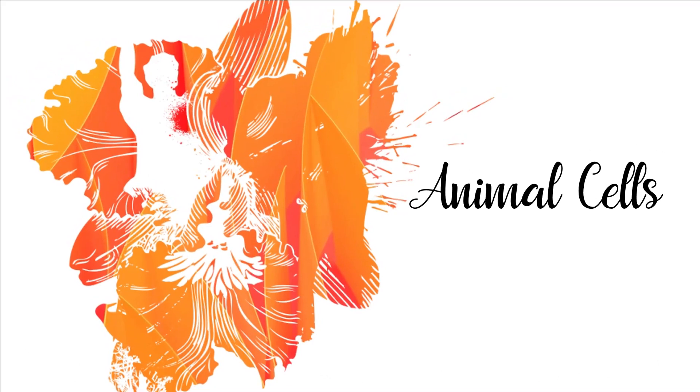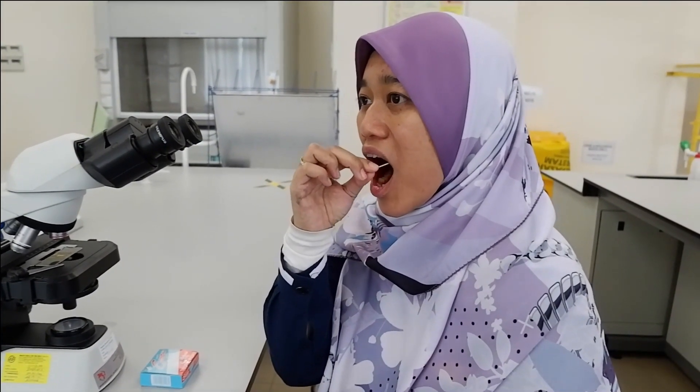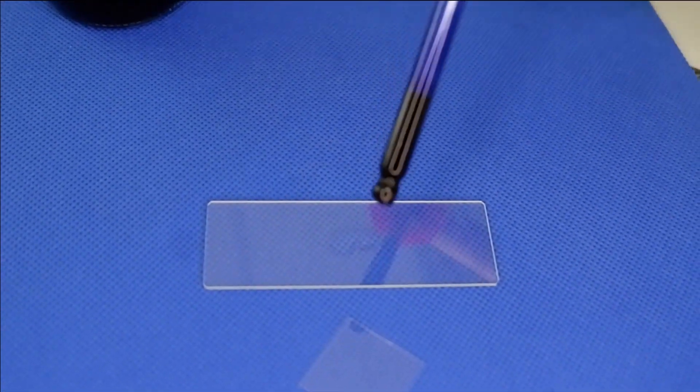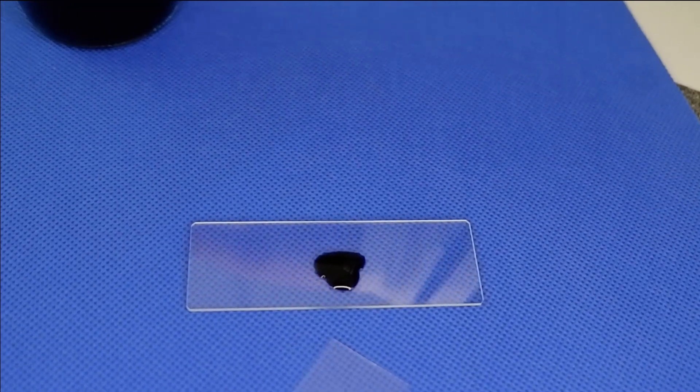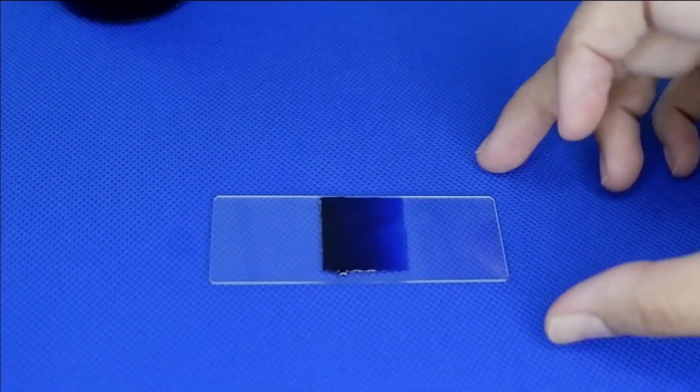For animal cells, we are going to use cheek cells and stain them with methylene blue. Use a toothpick to gently scrape inside of your cheek. Then smear and mix the cells in distilled water. Next, put a drop of methylene blue to stain the cell. Place one edge of cover slip to one side of the stain and slowly lower the cover slip.